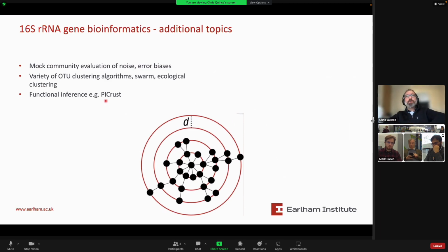Then you've got a profile of genomes, and you use that to reconstruct the total metabolic functional potential of the community. I was never very excited about PICRUSt, as I'll explain later on today, because to me, the aggregate metabolic potential of a community isn't terribly useful anyway. What you really want to know is who is doing what in that community. And for that, you can't avoid having to do metagenomics and assembly and binning, as we'll talk about.